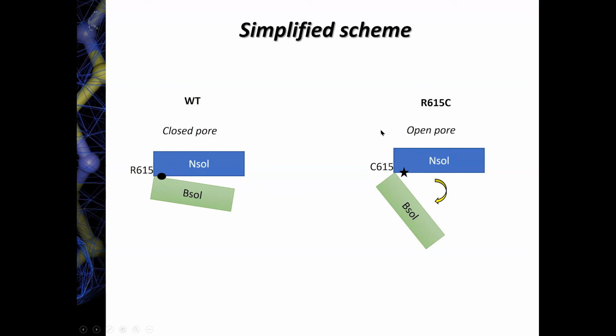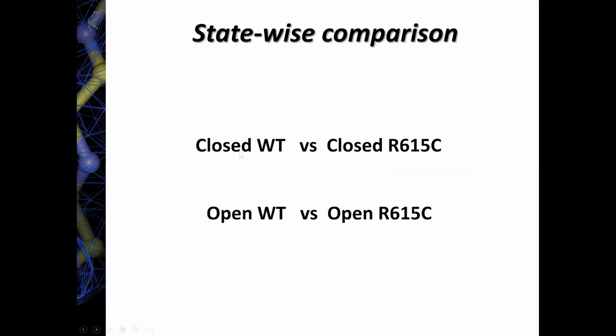Okay, so obviously wild type, disease mutant, it's a gain of function. It's kind of expected that opening is facilitated, but of course under physiological conditions, this mutant does not always display an open structure. Obviously it's still a channel that gates. So if we want to get a full picture of what's going on, we really would want to compare all the different states. And minimally, we'd like to compare a closed wild type structure with a closed disease mutant and an open wild type and an open disease mutant. So right now we just have closed wild type and open disease mutant.